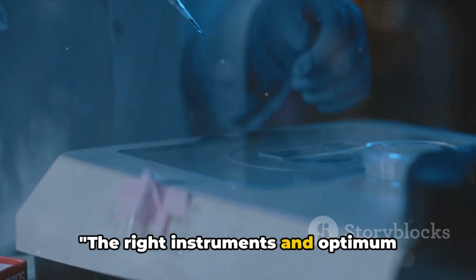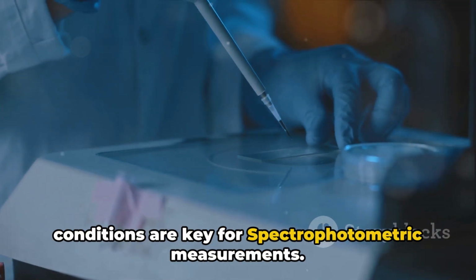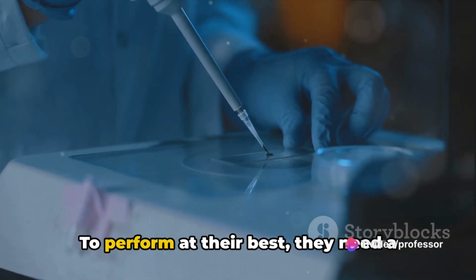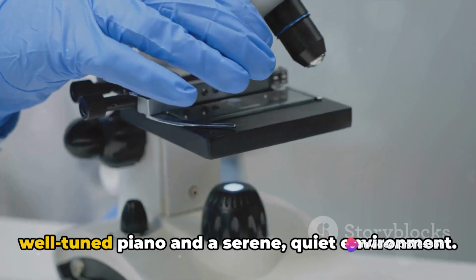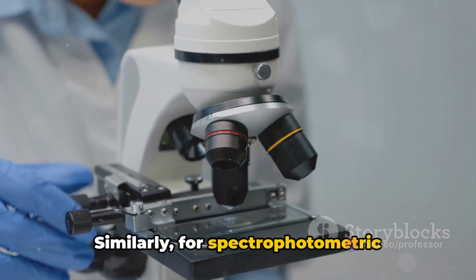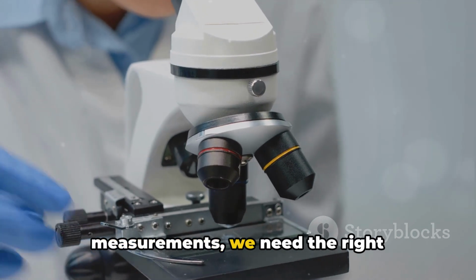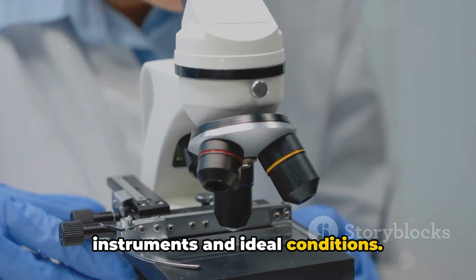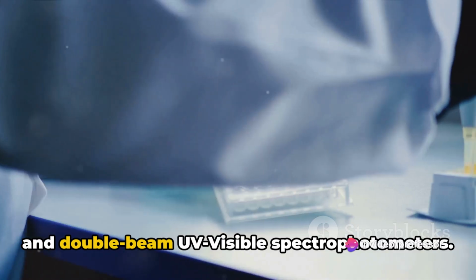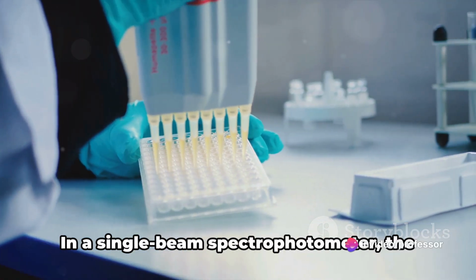The right instruments and optimum conditions are key for spectrophotometric measurements. Imagine a pianist. To perform at their best, they need a well-tuned piano and a serene, quiet environment. Similarly, for spectrophotometric measurements, we need the right instruments and ideal conditions. Let's delve into the world of single-beam and double-beam UV visible spectrophotometers.